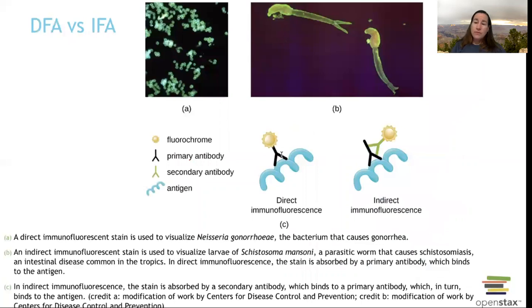We can use fluorescent microscopes when we're talking about immunofluorescence, and that is going to be a test that we'll talk about later on in the semester. But it's where we're trying to see if antibodies are attaching onto an organism. And we want to know, is this sticking on this organism? Are we looking at the right organism? Because if it is, that antibody is going to attach to it. If it's not, the antibody won't attach to it. And we can use immunofluorescence to detect this.